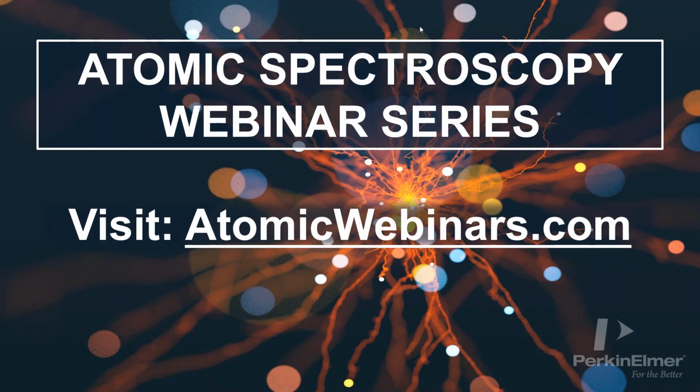And then just a bit of a comment with the question. Thanks for the nice presentation. I have done single cell ICP-MS of platinum inside cells cultured with platinum-based drugs using the NexION 2000 and single cell application. The intracellular contents of platinum measured were clearly lower than the ones obtained by the traditional method with acid digestion of cells, although the cells were well preserved before single cell analysis. Also, various washing steps of cells were done prior to analysis. Is there any explanation for the difference between the two methods? I'm assuming the bulk analysis and the single cell analysis.